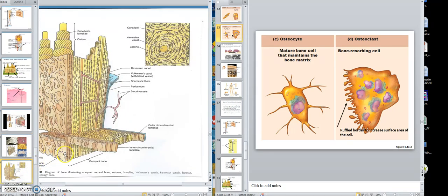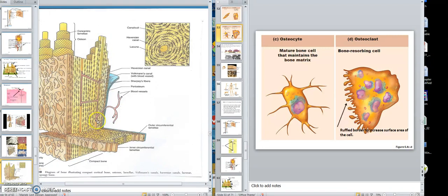Right here again is to show that sliver coming from that long bone, and here would be your osteons with your concentric lamellae. Here would be the Haversian canal — named by the guy that described it but also known as the central canal — that's where the arteries, veins, nerves, and everything are in. Here are the concentric lamellae, so you've got plenty of pictures to kind of get an idea.